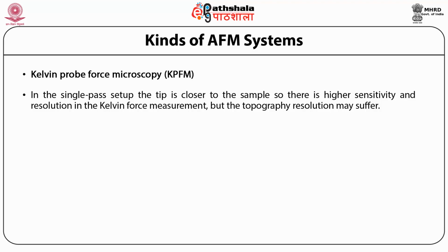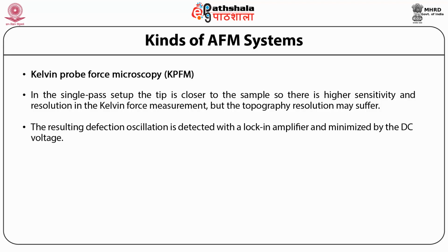A combination of AC and DC voltage is applied to the cantilever, causing an oscillating electrostatic force between tip and sample. The resulting deflection oscillation is detected with a lock-in amplifier and minimized by the DC voltage. The DC voltage used is the local contact potential difference, or CPD, between tip and sample.